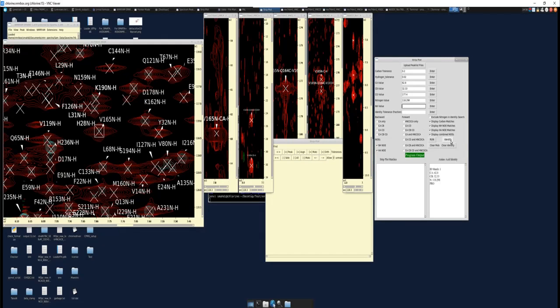So if you click identify, right, according to this at 62.8 and 32.33, right, with this nitrogen value, this correlates with a proline. And the reason that it doesn't correlate with a valine is because the range of tolerance is pretty small to begin with, right?